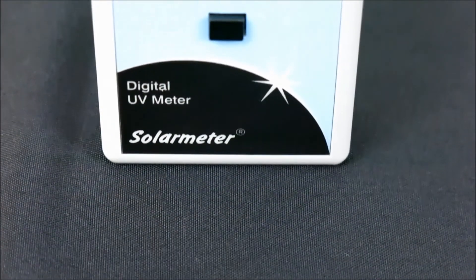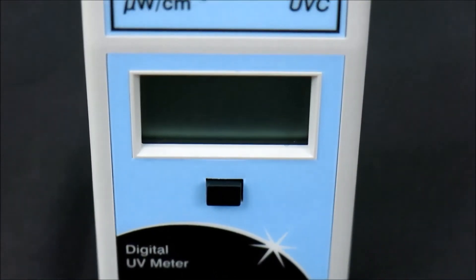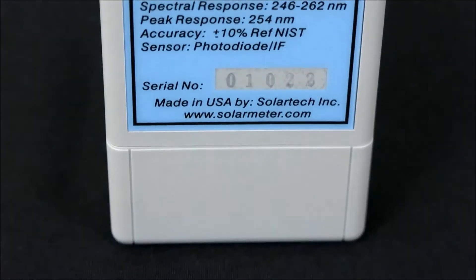The Solar Meter Model 8.0 is a great choice for manufacturers of UVC lamps and sterilization cabinets, service technicians for UVC air or water purification units, and food processors using UVC light for germ killing.